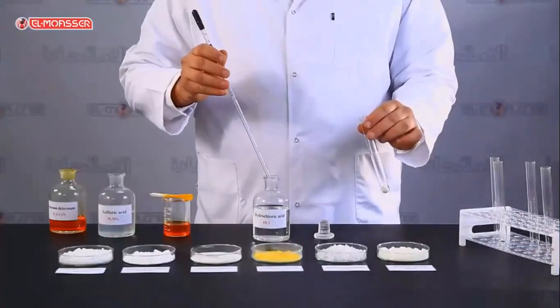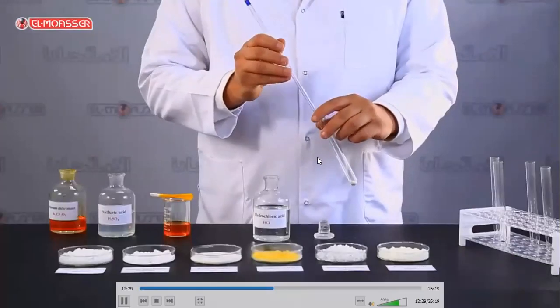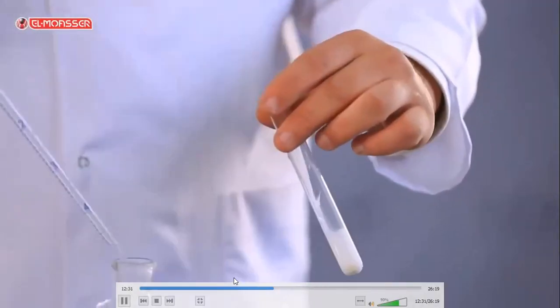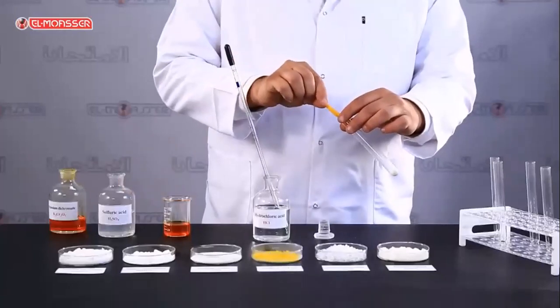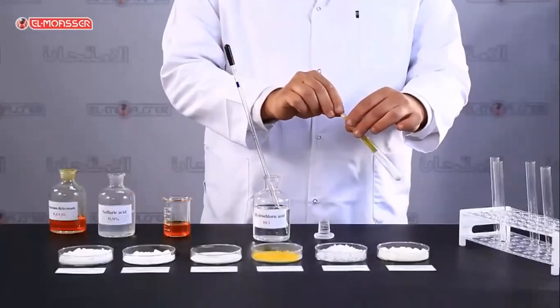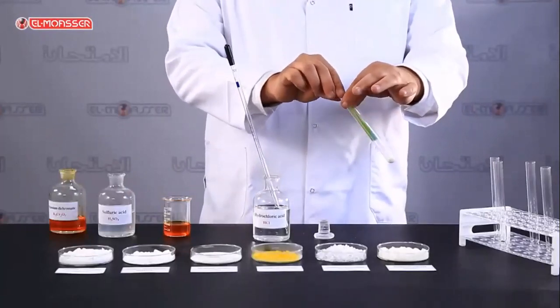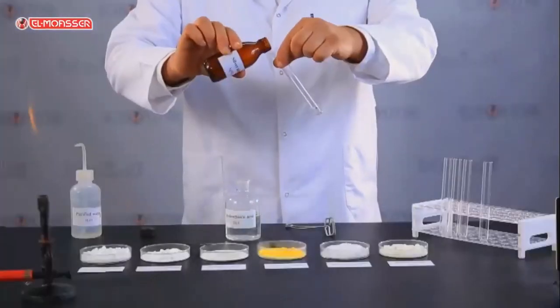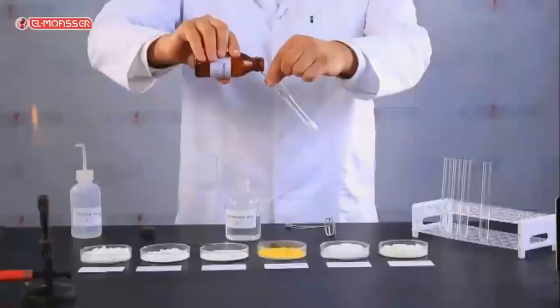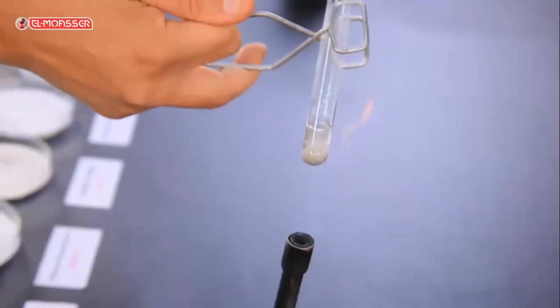Summary. On adding diluted hydrochloric acid to sodium sulfite salt, a sulfur dioxide gas evolves. That changes a paper wetted with acidified potassium dichromate from orange to green. On adding silver nitrate solution to sodium sulfite solution, a white precipitate is formed which changes into black by heating.